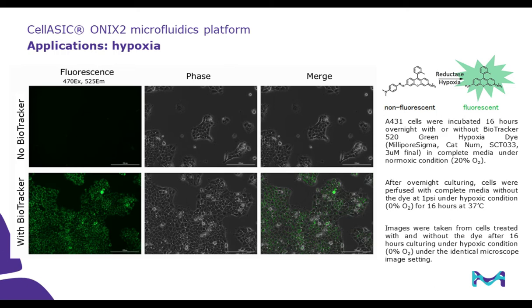Now let's look at intracellular oxygen level and how it is affected by hypoxia. Here we are going to use an intracellular hypoxic probe, BioTracker 520. This probe is highly cell-permeable and becomes fluorescent only inside of the cell under hypoxic condition. Images show A431 cells loaded with and without the probe and subjected to hypoxic condition for 16 hours using the CellASIC setup. The image on the bottom left shows the cells becoming bright green due to activation of the intracellular hypoxic probe.